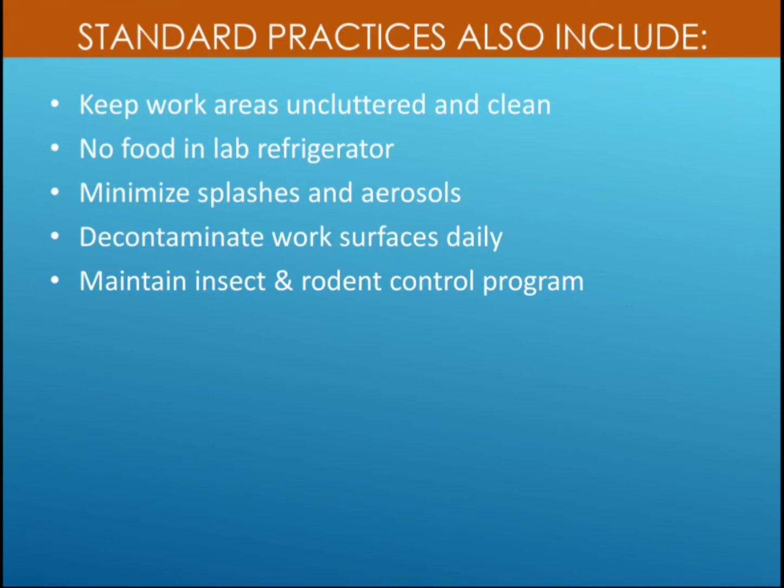Then we should decontaminate the work surfaces daily, and we have to maintain the insect and rodent control program, because insects and rodents also disturb the air quality, and they carry various types of pathogens from the outside environment and transfer them into the inside environment. That's why insects such as flies, mosquitoes, and rodents such as rats, mongooses, lizards, cockroaches should be avoided by maintaining pest control programs.